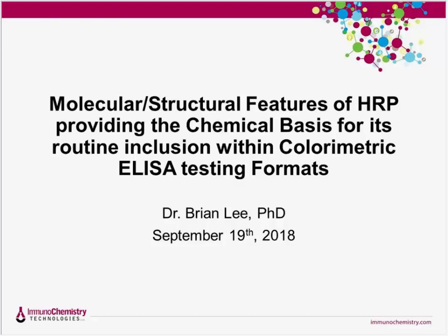The discussion topic that I chose for today's webinar will correlate the presence of three separate molecular structure elements of the HRP enzyme with their corresponding positive impact on the HRP's performance as a stable, high substrate turnover rate redox enzyme.